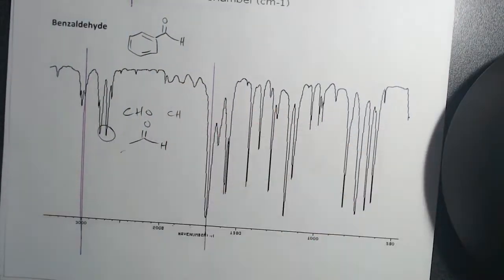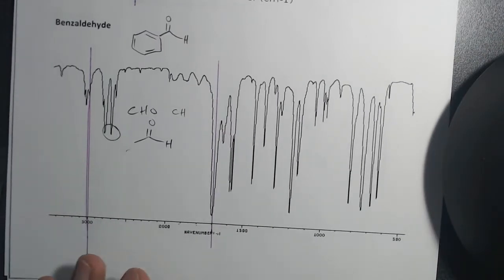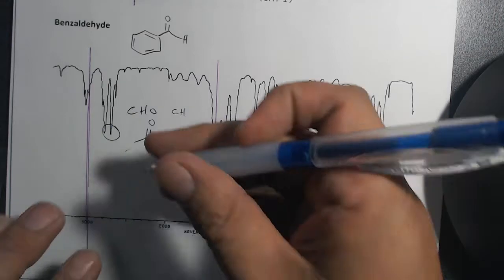They typically show up as a double peak, and they are kind of buried with the alkane CHs. So unfortunately, sometimes we can't see them, because if you happen to have CHs in there that are overlapping that, you can't see them. The thing is, though, that they do have roughly the same intensity when they appear. So it can be a tell for an aldehyde. So suppose I thought I may have an aldehyde by observing the double peak here. I just want to make sure you guys are clear on that.